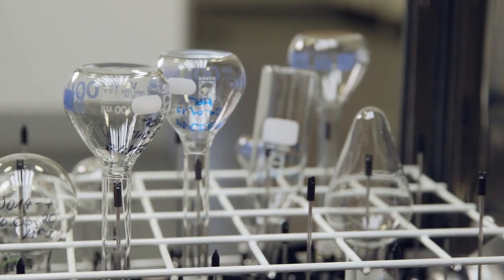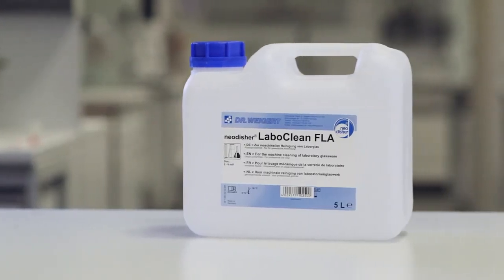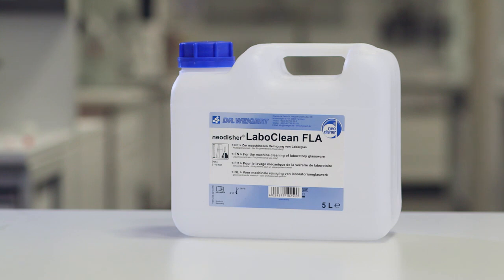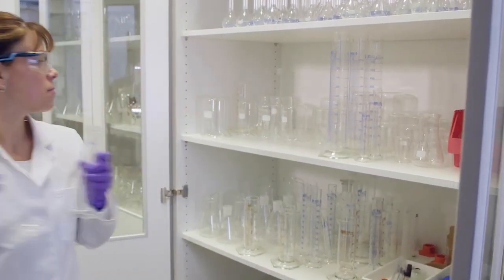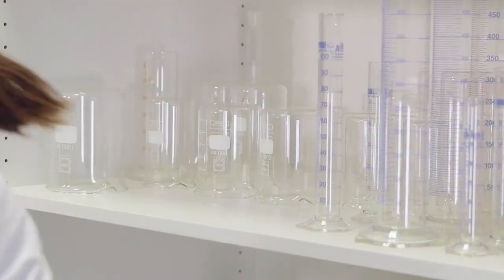Dr. Weigert recommends using Neodisher Laboclean FLA. This way, you avoid time-consuming manual reworking and achieve optimum cleaning results.